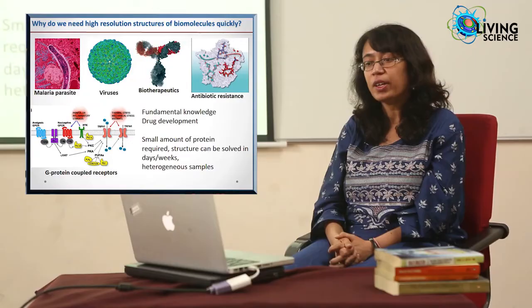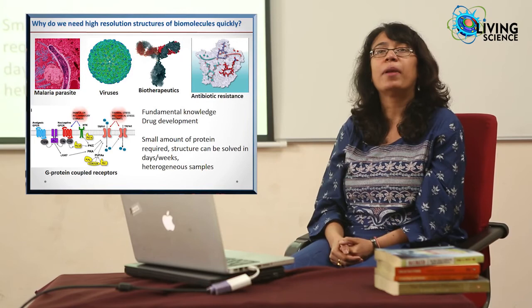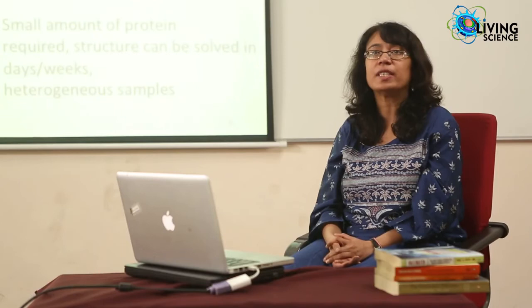So given all of these advantages and the requirement for understanding biological processes by looking at high-resolution structures of macromolecules for drug development needs, I think this technique is here to stay, and with the improvements and the current very high resolution methods that are available, this is going to become a primary technique in drug development and in structure function studies in future.